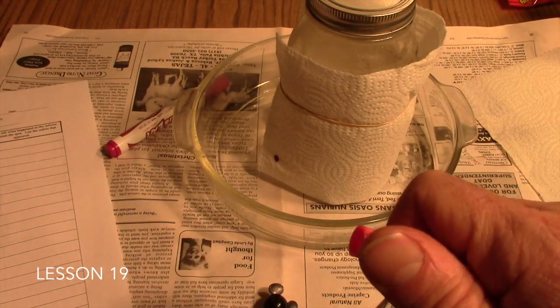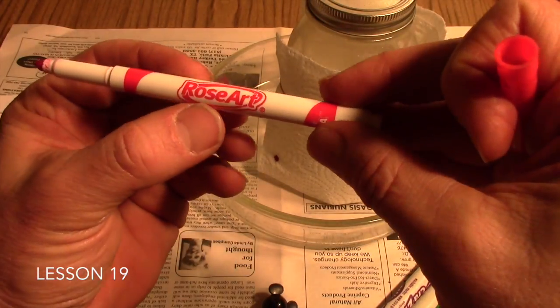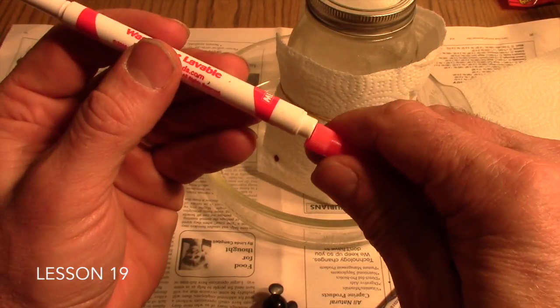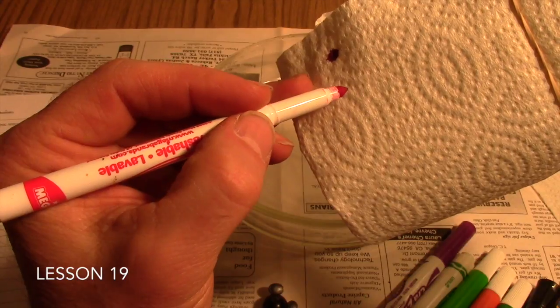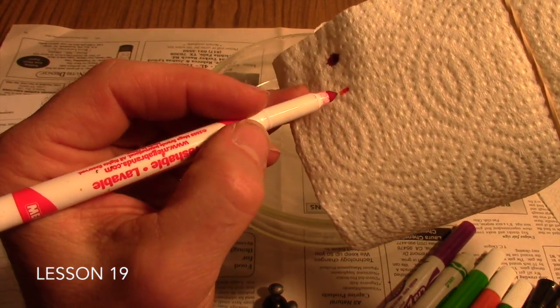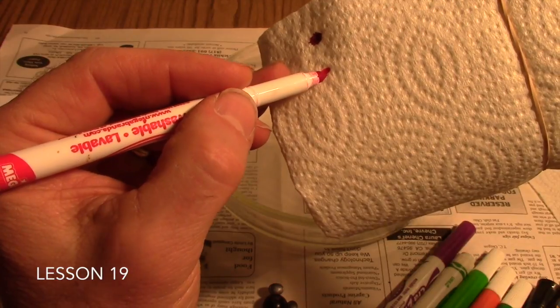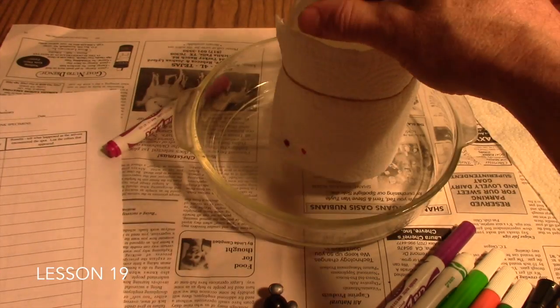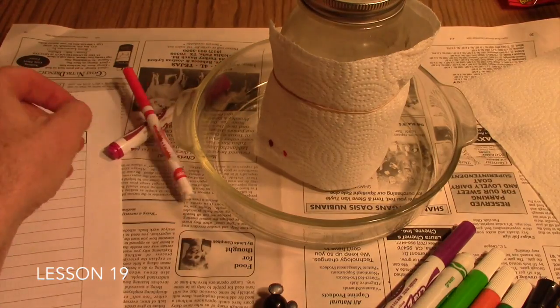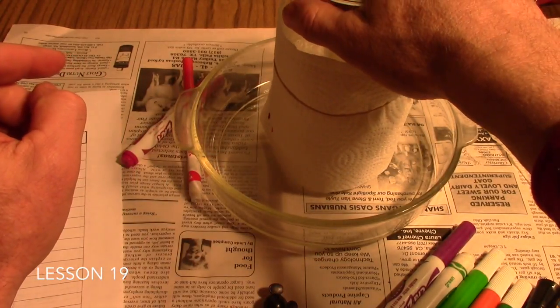This one here we'll start with back on our data table, we'll make a mark there. And we'll write down, it says it's a Rose Art and it's a washable marker. And then we'll go back to our paper towel. Now we want to come over about an inch and then we'll again make a spot about the same distance from the bottom. So we'll touch, let it dry, touch, let it dry, and we'll get a very concentrated spot of ink there. We'll just repeat this process of putting spots all the way around the base of our paper towel.